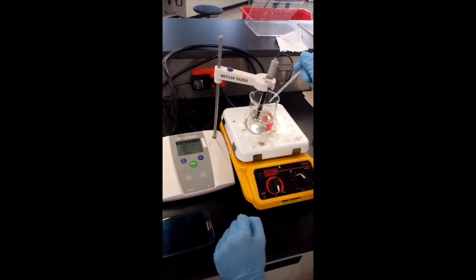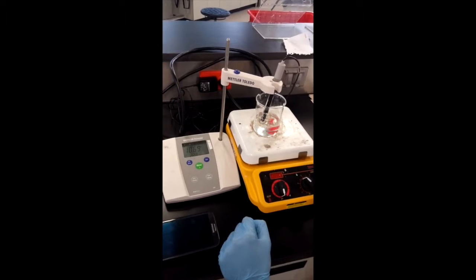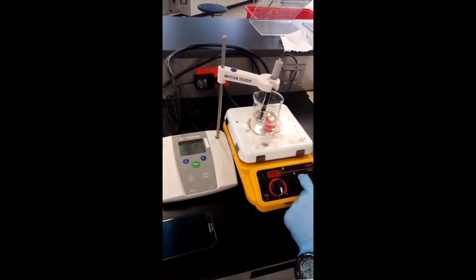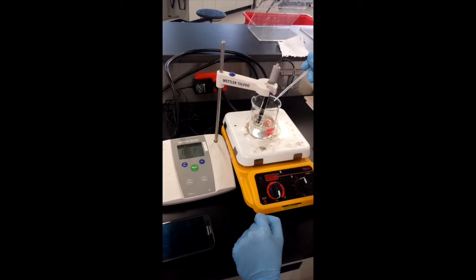The loading buffer was prepared by diluting the stock that was previously made in the laboratory. The 5 milliliters of loading buffer contained 1.5 milliliters of glycerol, 200 microliters of the stock solution, and the remaining 3.3 milliliters of distilled water.